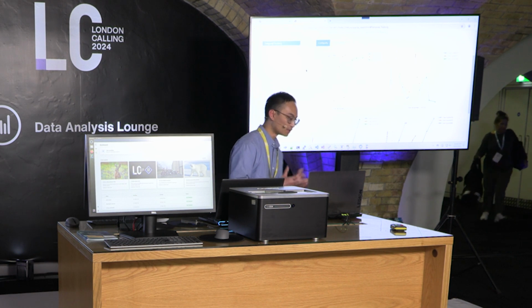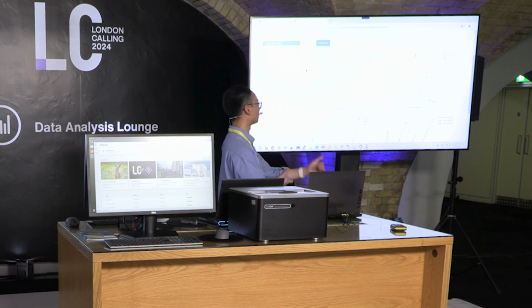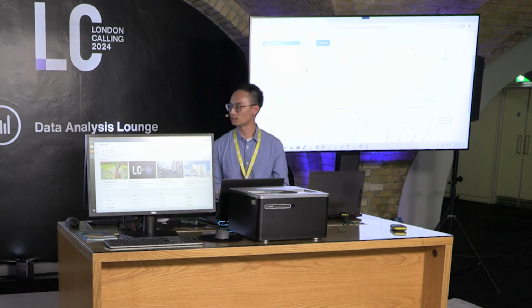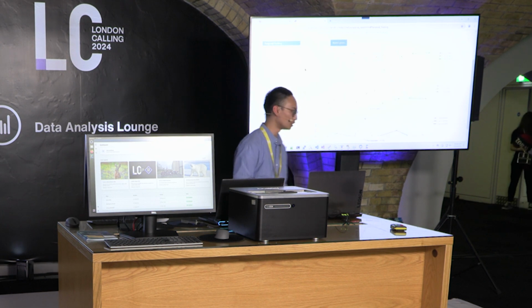We can see that the assembly size grows exponentially. We can also see that the number of contigs reduces exponentially, indicating that these genomes are becoming more and more contiguous as we generate more sequencing data. And if we look at the marker gene analysis, we can actually see that these genomes do become more and more complete over time.